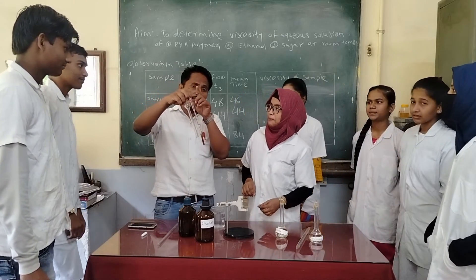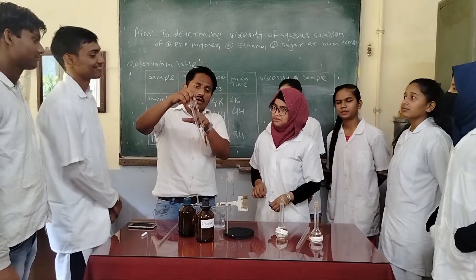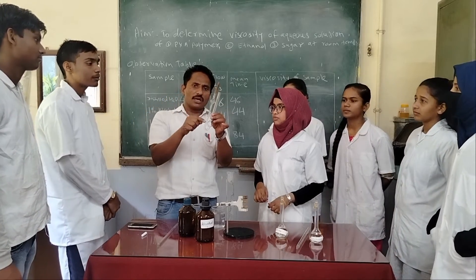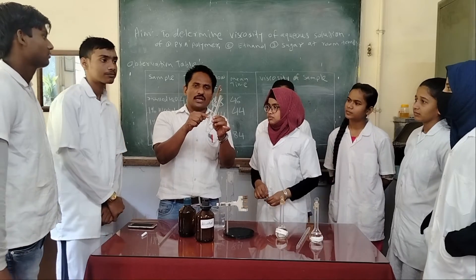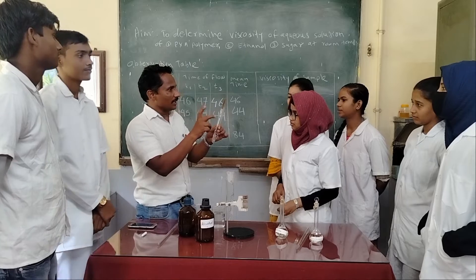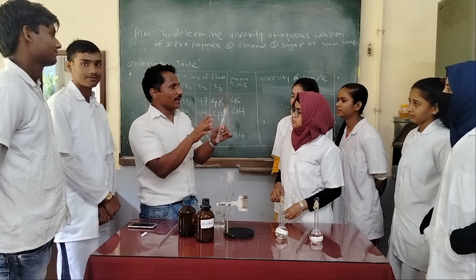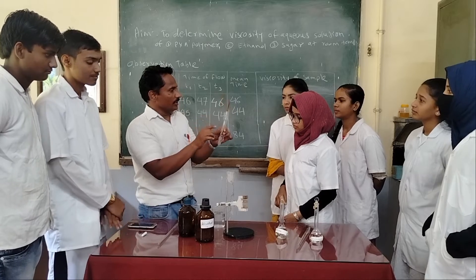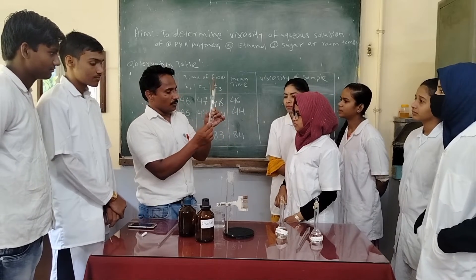Remember that all scientists should always hold the viscometer from this side, never from this side, because this side is very delicate — it is made from capillary glass, and you know how delicate capillary is. The viscometer will break or be spoiled. Always hold the viscometer from this side or from the bottom.